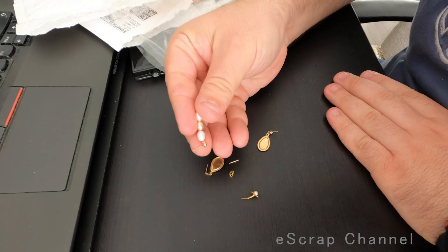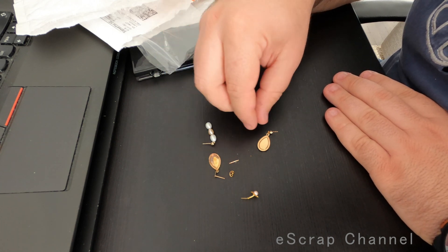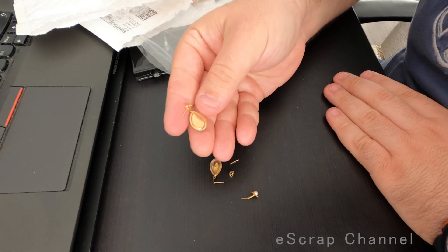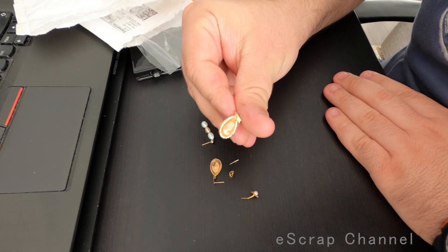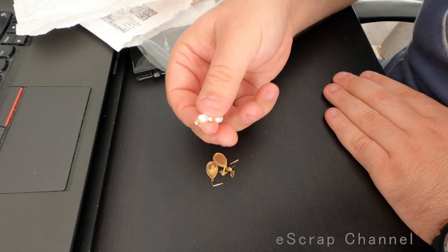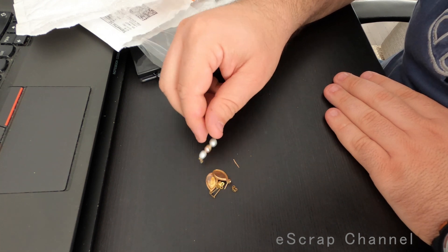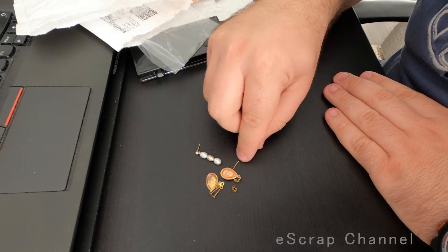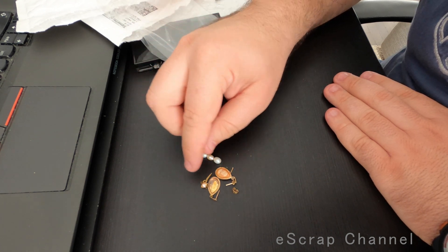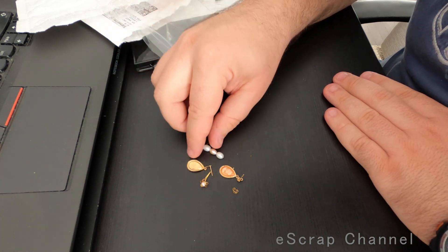Here we go — so some pearls, some low-carat gold, this one is an earring, and some other pearl. So what I will do with this scrap material: this is nine-carat gold, I will quickly process it and refine it to 24-carat gold.